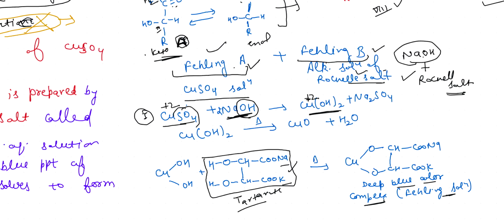Now, this cupric hydroxide will react with Rochelle salt. Upon reaction with Rochelle salt, there is removal of two molecules of water.